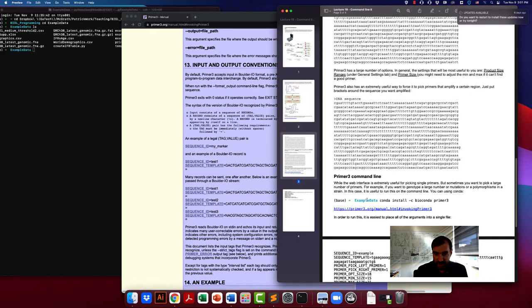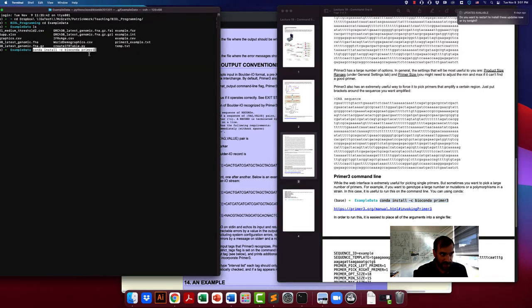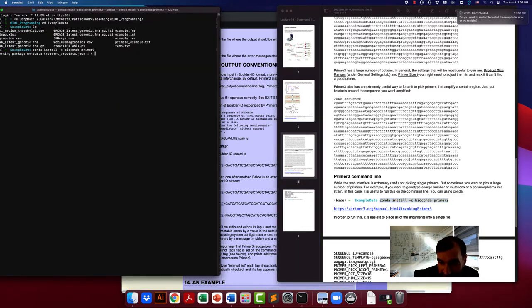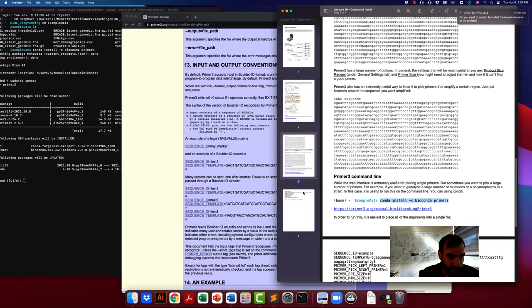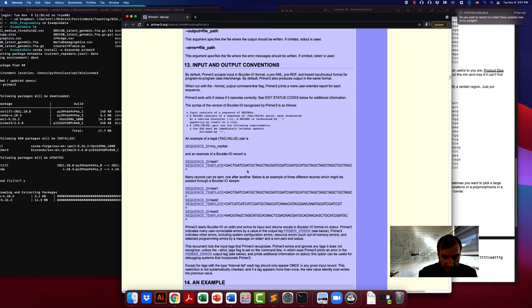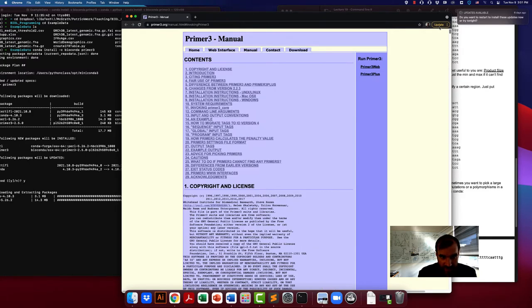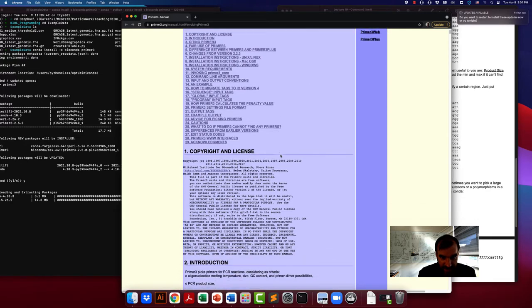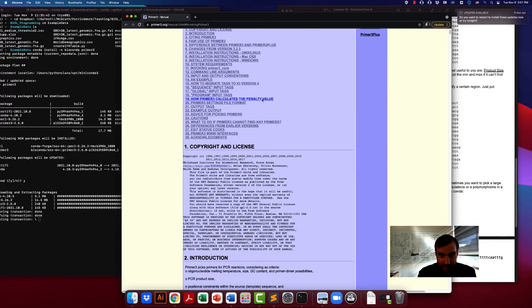Now we are going to go over how to run Primer3 at the command line. First you have to install the Primer3 program, and using conda install is the easiest way to do this. There's a manual page at the following link, so go ahead and install that. The manual goes over all of the options for how to use it, but we'll go over the basics.